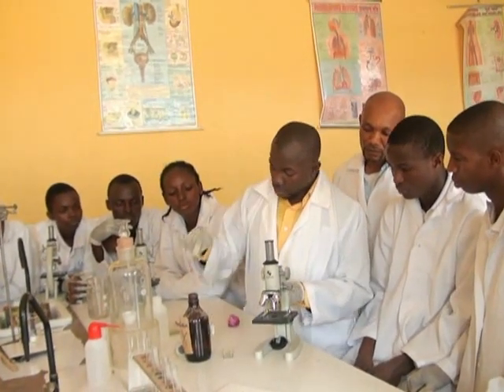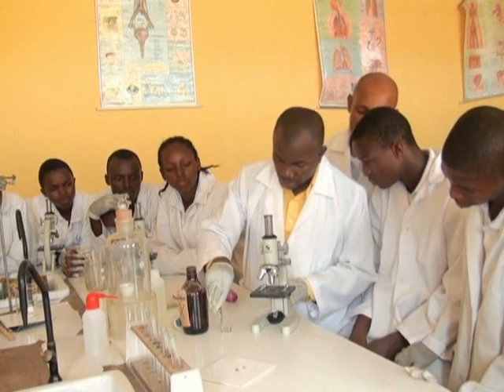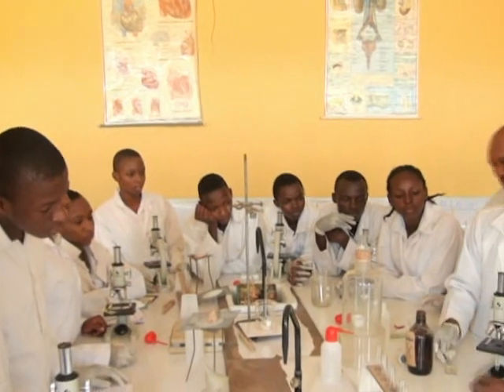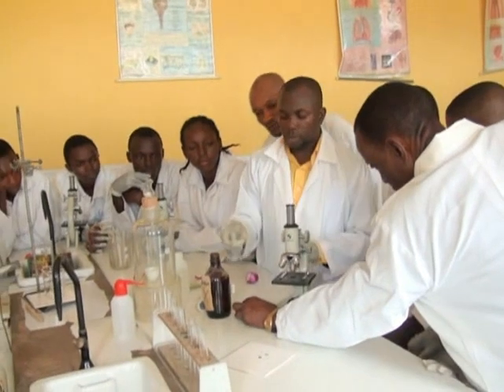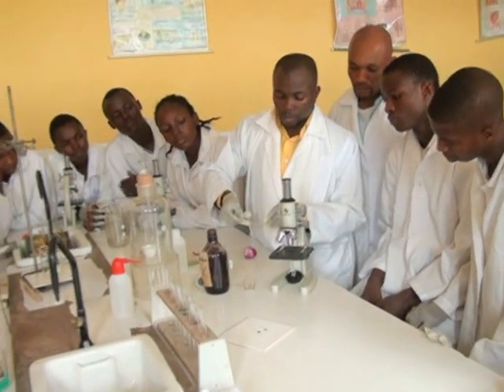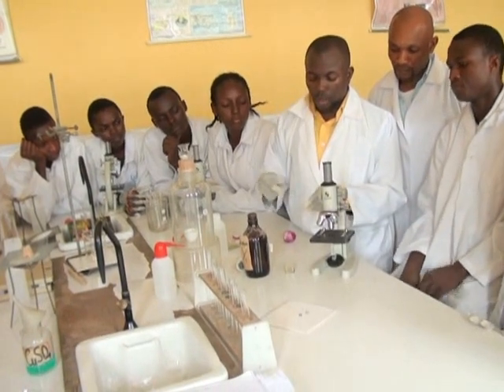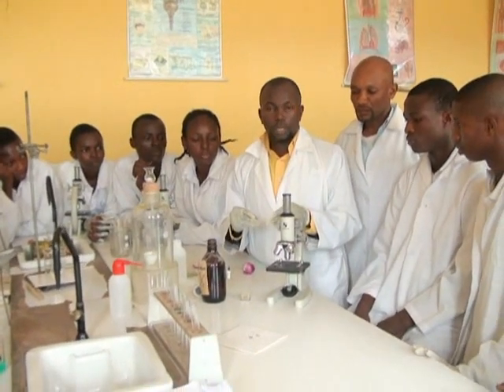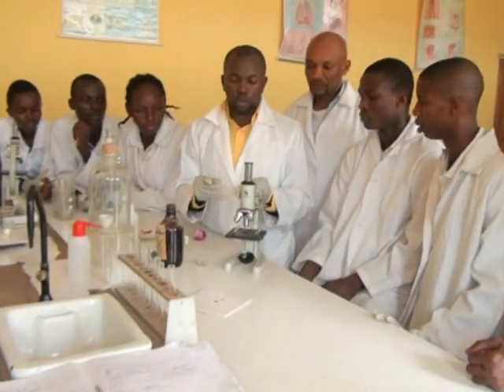We now use the tweezer, collect one cover slip, just one, and cover the specimen. Do it gently and carefully. Cover the specimen. So the essence of covering with the slip is to prevent what? Contamination and air drying. Do it gently and carefully to avoid trapping air bubbles.